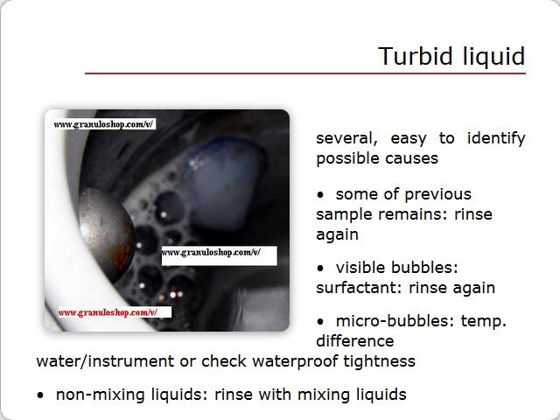Retighten nuts and check for leaks. In the very rare case where you use several non-miscible liquids, make sure to use well-mixing liquids for rinsing between runs, as two non-miscible liquids will emulsify. We recommend that you check that the liquid tank is clean. Scrub the circulator reservoir with a swab or scraper and, from time to time, wipe underneath the Teflon detector to remove pollution.